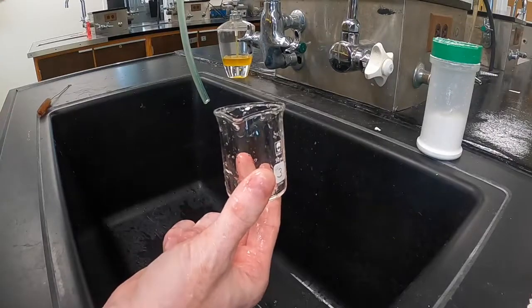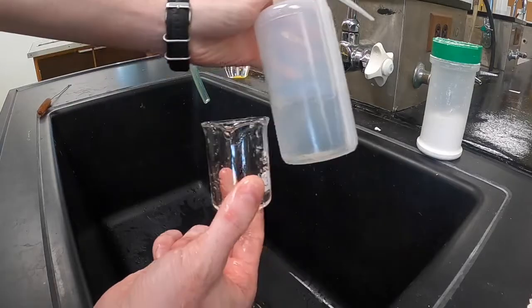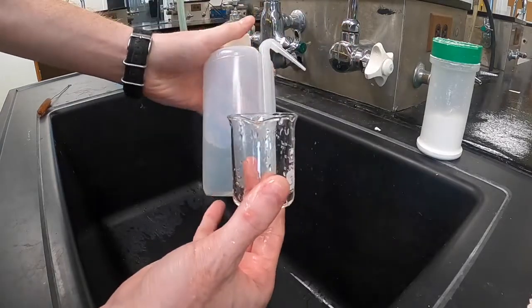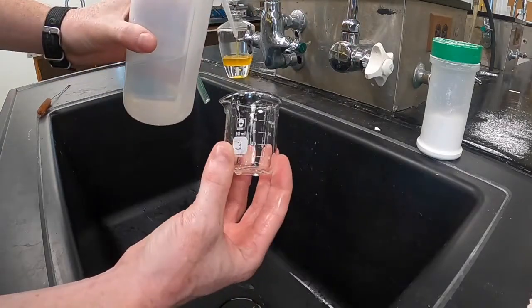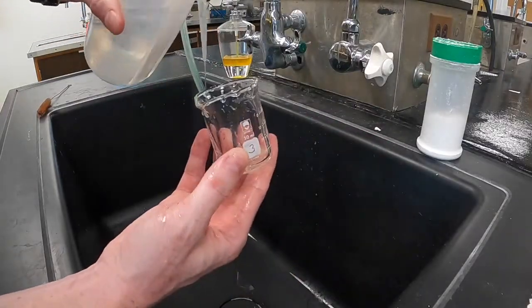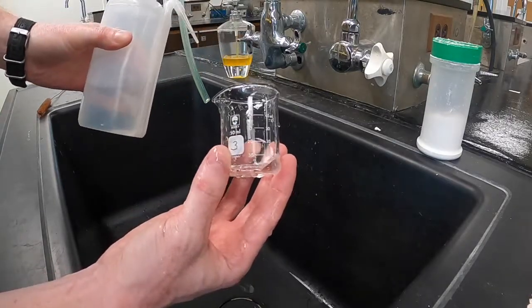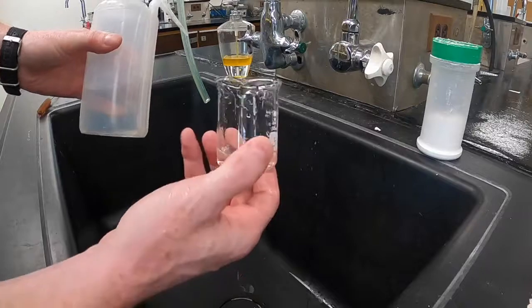Once you've done your tap water rinses, you can move on to rinsing with distilled water. The distilled water rinsing step should involve three rinses with small portions of distilled water, no more than 10% of the total volume of the container. So if your container is 100 milliliters, you shouldn't use more than 10 milliliters of distilled water at a time.